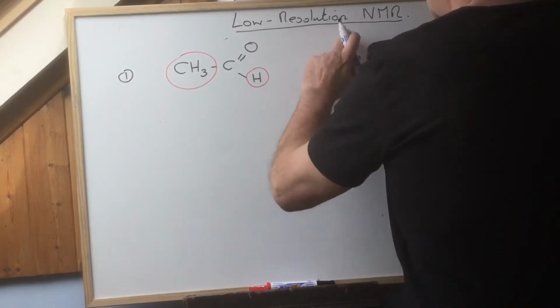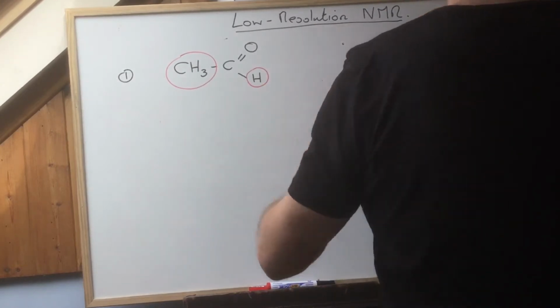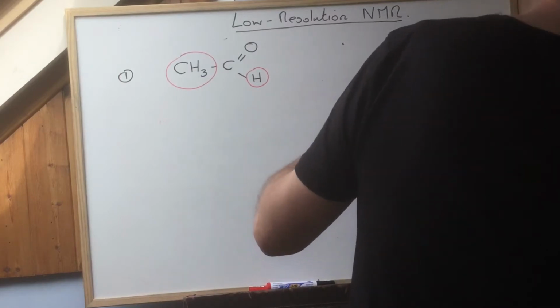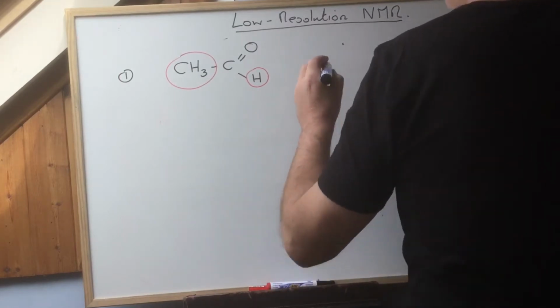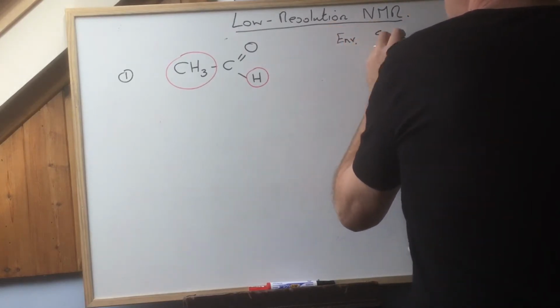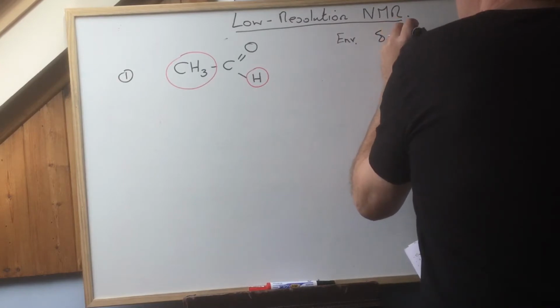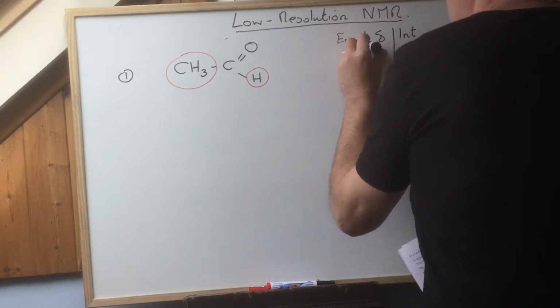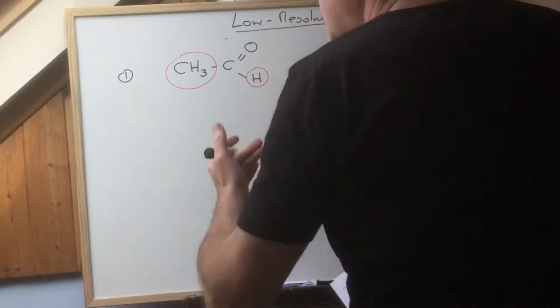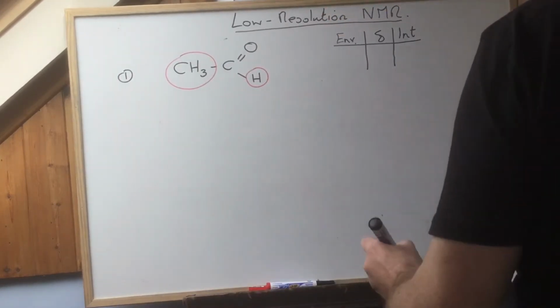What will we have? Environment, that's right, it's all coming back. Chemical shift, integration. That'll do for our very first little table, but force yourself to do this every time you do one of these, okay?